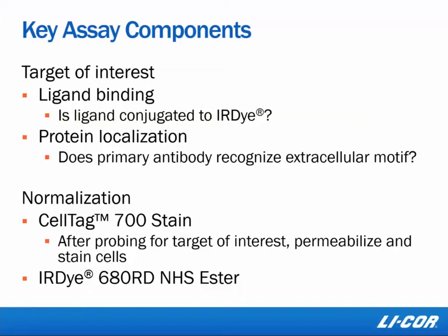Now, as with the In-Cell Western Assay, you want to make sure to normalize your signal from well to well for these plates.